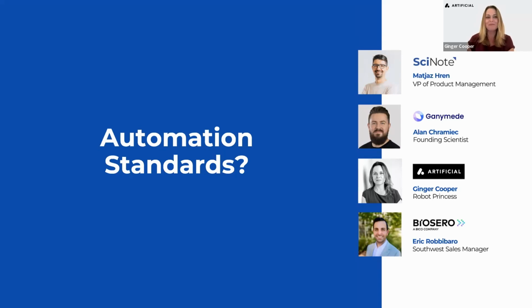It used to be really complicated with a variety of different formats. Things are starting to standardize a little bit more on their own. And I think the more the industry needs it and wants it, the more it will drive in that direction. That's personally what I think. It just takes a while, right? Scientists in general, or anybody, don't like change. And so change happens a little more slowly when it comes even to instrumentation and software. It goes back to, if all your processes are set and everything else is done, why are you going to mess with it? So the evolution here just takes a little bit longer to standardize, but I do think it's coming.